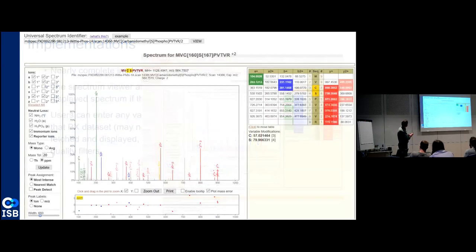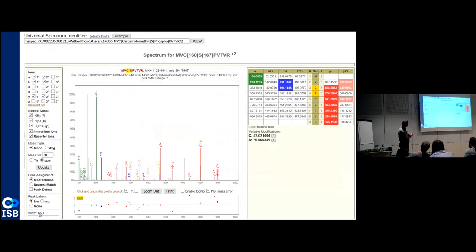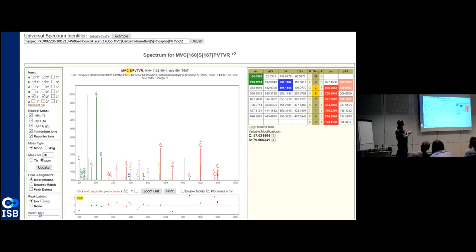Here it's zoomed in — actually this is a different spectrum, and now you can actually read it. Here it is: PXD 2286, originally deposited at Pride, which we downloaded and reprocessed. Here is the MS-run name, the scan number, and here is our interpretation. We came to this spectrum by browsing the Peptide Atlas repository — looking at a certain protein, a certain phosphorylated peptide. In Peptide Atlas, you can view any of the spectra in the resource. When you bring up the spectrum viewer, it fills in the universal spectrum identifier for that spectrum.